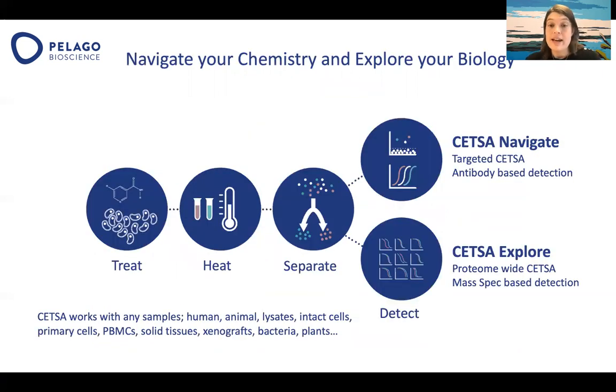We see CETSA as one assay with two different readouts. It shares the same assay protocol, which is treat, heat, separate, and then detect. I'm going to talk about the CETSA Navigate, which is the targeted CETSA based on antibodies for the detection.